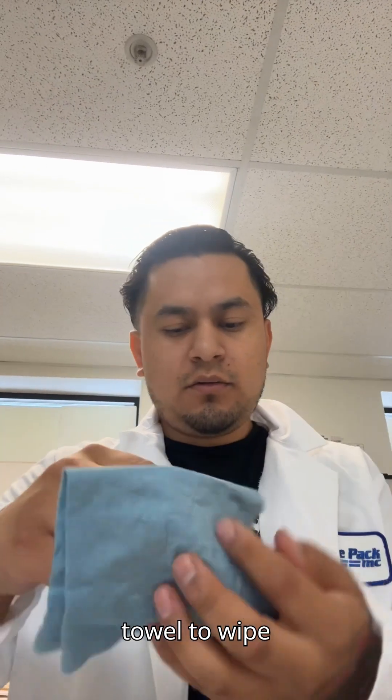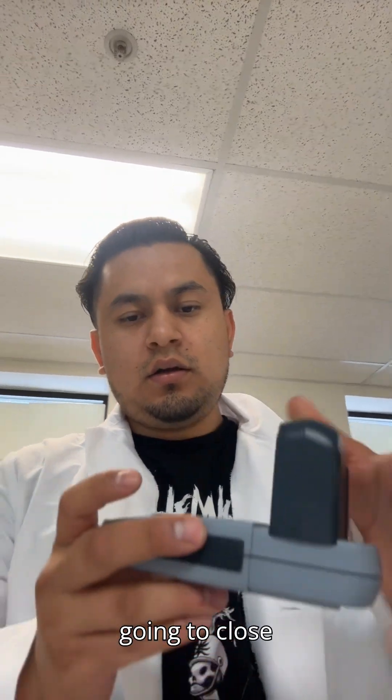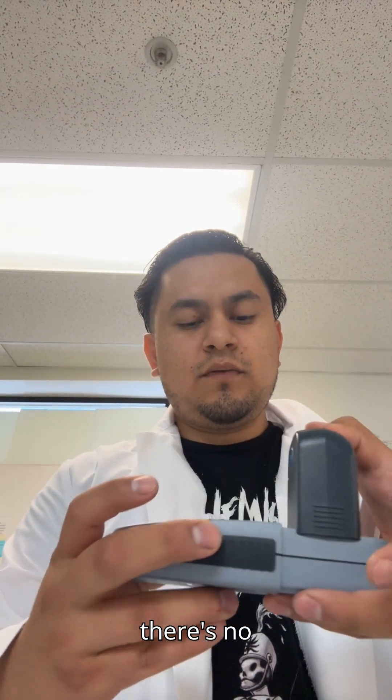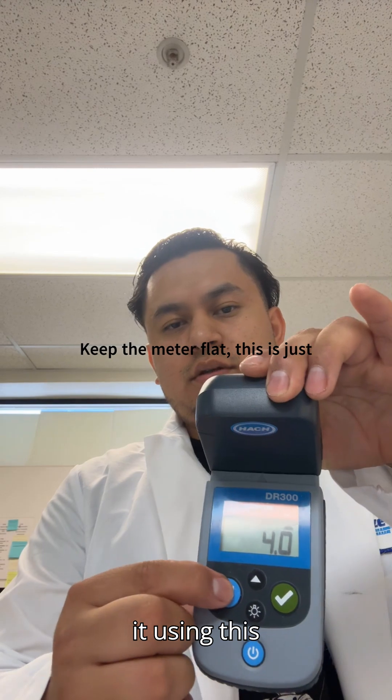Close it up, and make sure you use a soft towel to wipe off any water that may have stayed there. Then close the lid, making sure there's no light coming in. When you turn it on, you're going to calibrate it using this blue button.